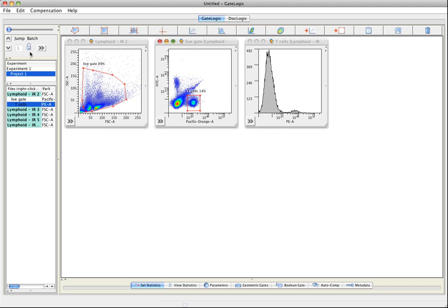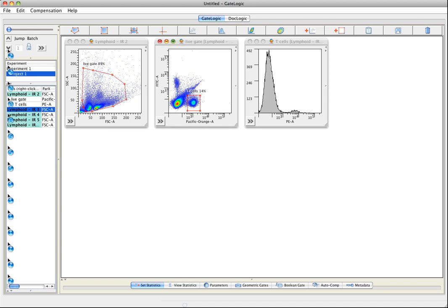We lock the padlock for batching and now click on the down arrow. This will transfer the gates and statistics and compensations to the next sample.